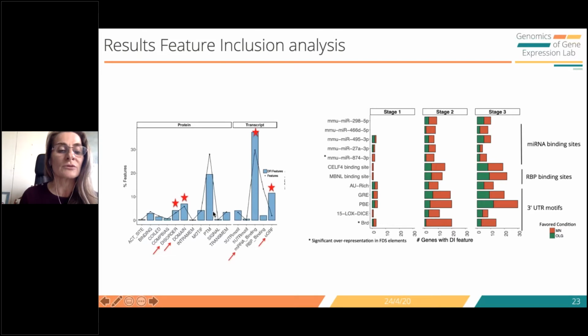condition to another. For example, here we are again looking into 2 different conditions in the mouse neural system, and we can highlight which type of domains tend to change in this way as we are measuring, as I mentioned before. And we see that, for example, PFAM domains tend to change in a significant way, or microRNA binding sites tend to change as well. Upstream open reading frames are significant, so we can evaluate how strong is the enrichment of these functional changes across the different experimental conditions.